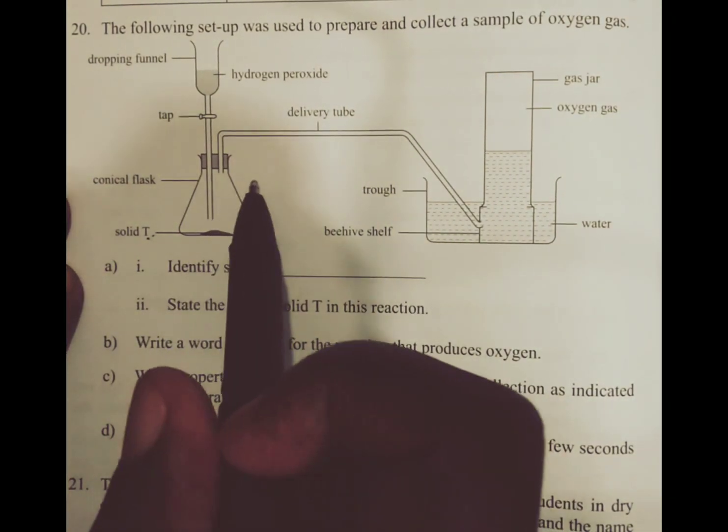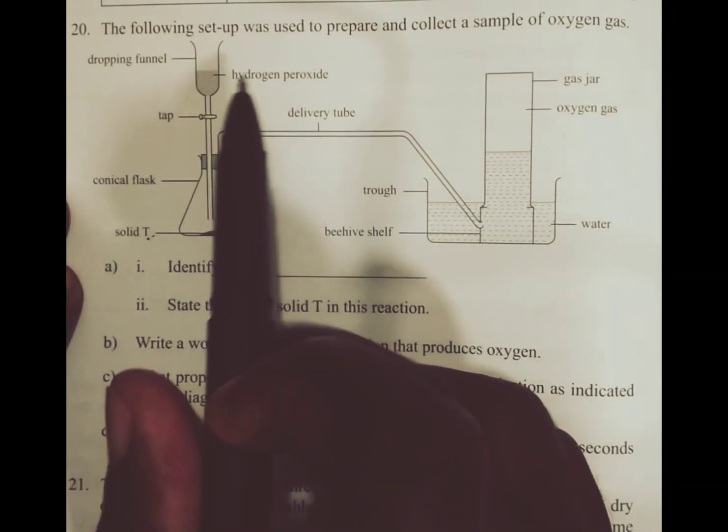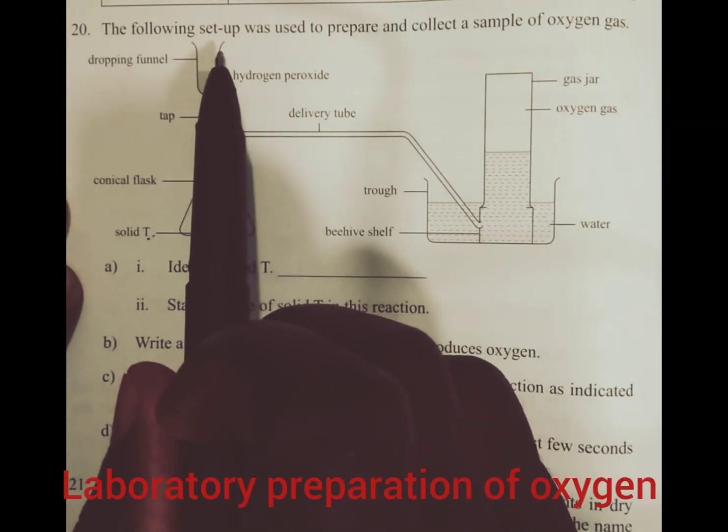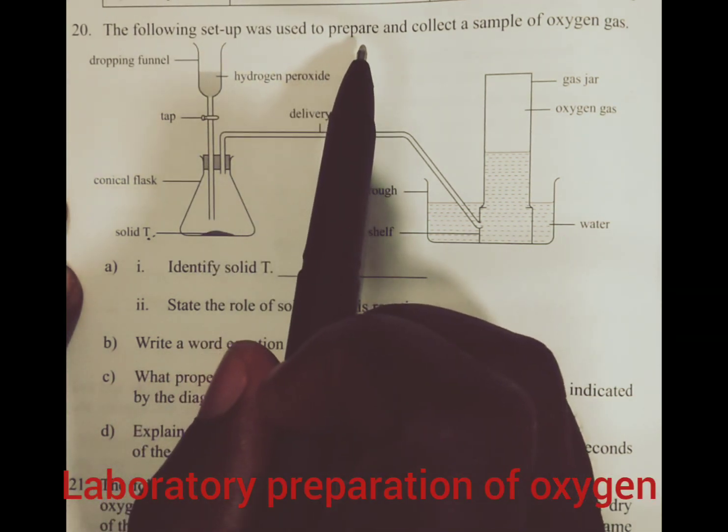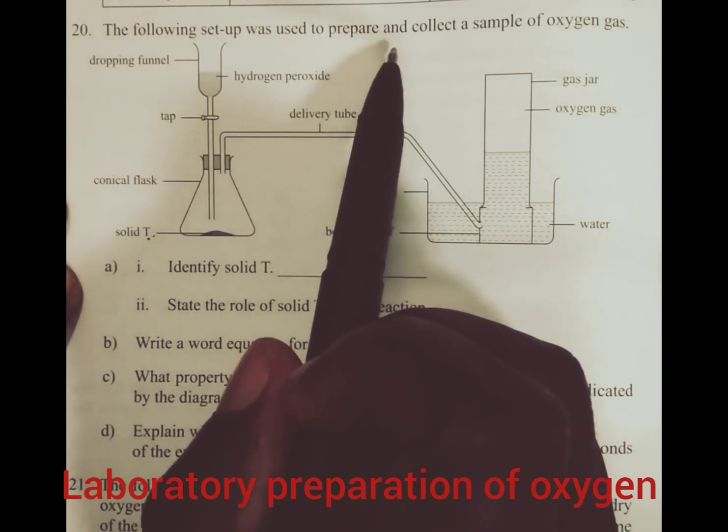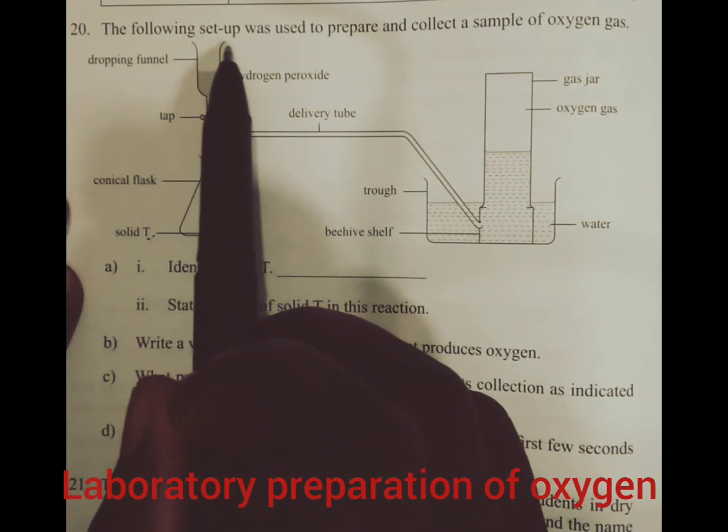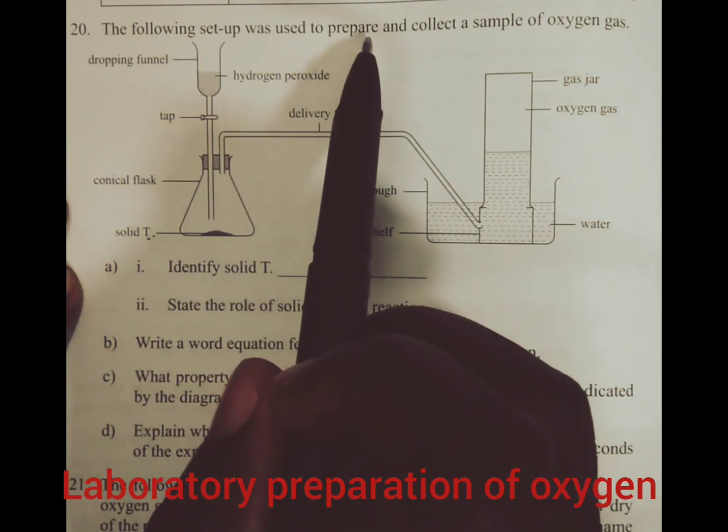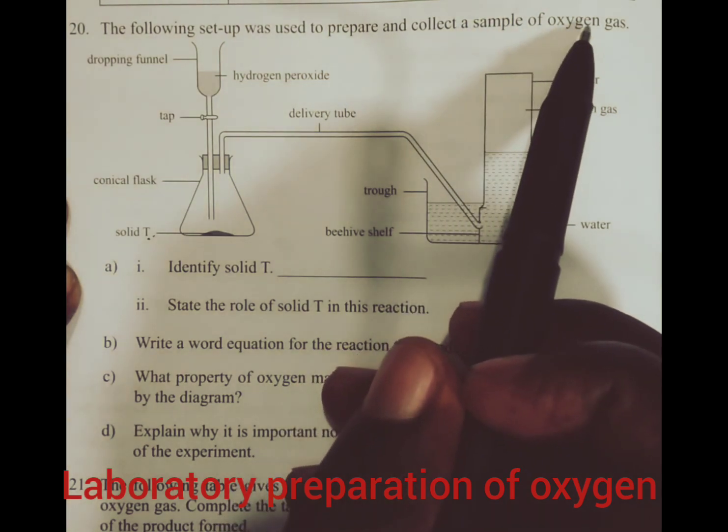Welcome to the discussion. We are presenting a question on the laboratory preparation of oxygen gas. The following setup was used to prepare and collect a sample of oxygen gas.